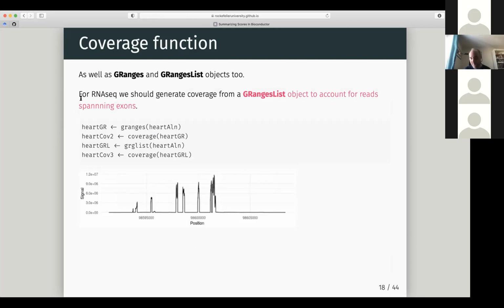But also, if I wanted to do really anything, I can actually use GRanges and GRangesLists, and I can make coverage from them too. So now we could take BED files and make coverage, create our own GRanges internally of some metric over some regions, and we can create something we can visualize in our coverage first, an RleList, and then we can export that to visualize in IGV.